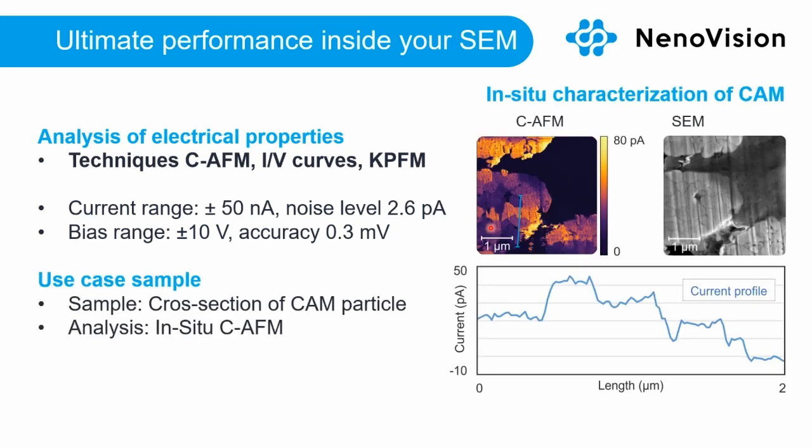What that means, I can show you on this example again. It's a cathode active materials cross section, and because of the performance, we are able to measure and analyze the inner structure of the particle and actually see the local conductivity of the individual grains.